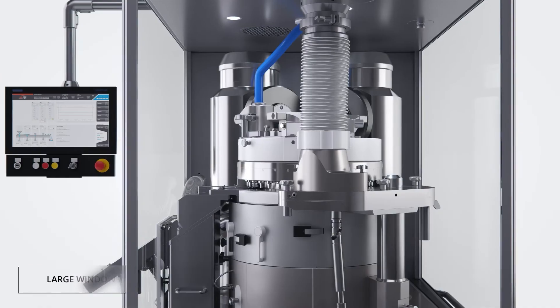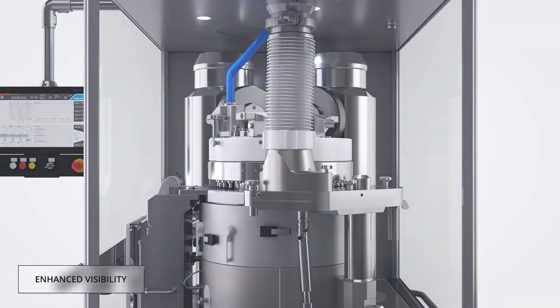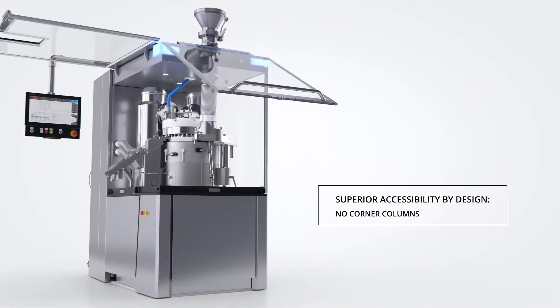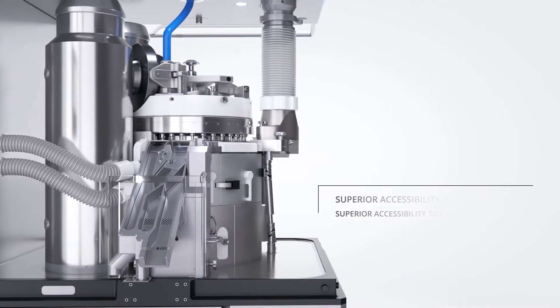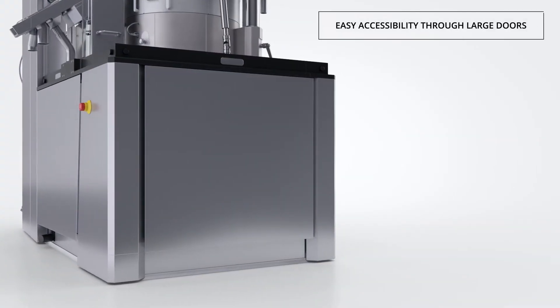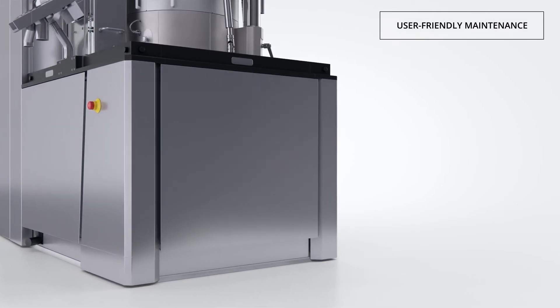The machine features large windows for excellent visibility on the process. Our design eliminates the use of corner columns, resulting in unlimited access to the press zone. Located under the carrier plate, the machine base is easily accessible through large doors and features ample free space for user-friendly maintenance.